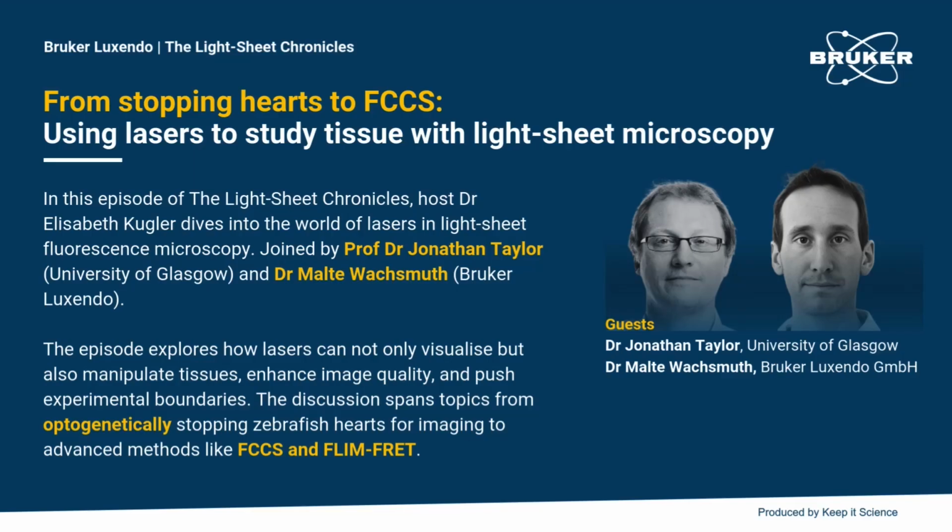But if you can do that, then you're learning a whole lot more about, in my case that I'm particularly interested in, the living tissue that you're imaging that you couldn't image just through structural imaging. Yeah, and I also know that you're taking all of this to a completely new level. You're not just using FLIM, but also FLIM-FRET tension sensors, which is really next level imaging. Can you talk with us about what you're doing there and what is so exciting about it?